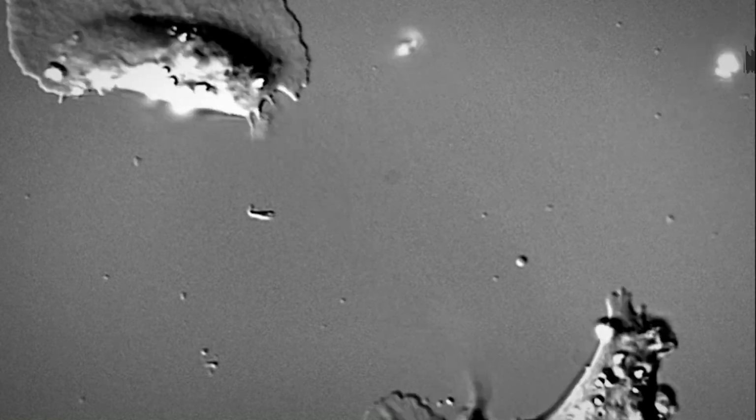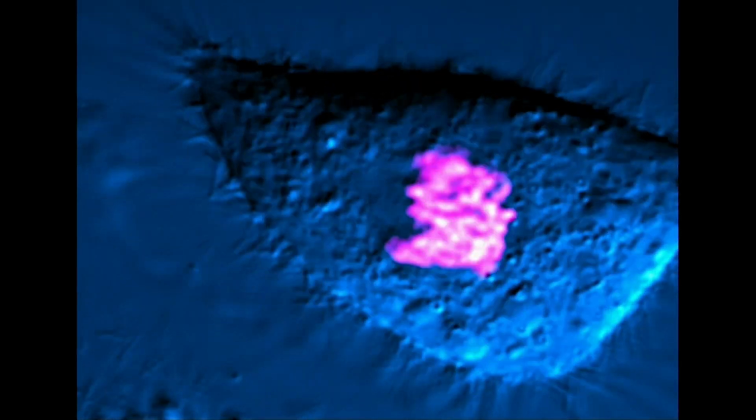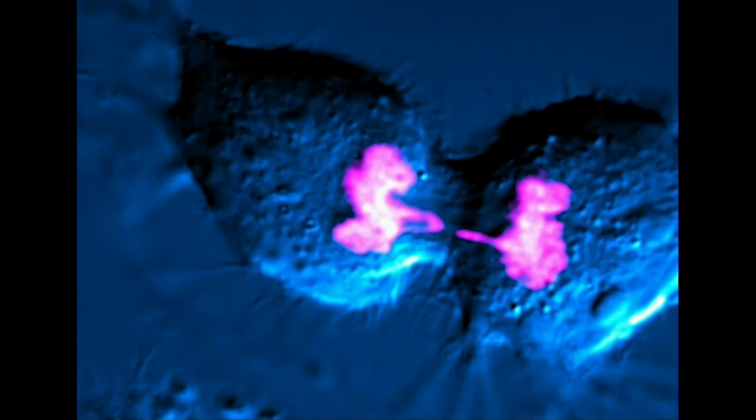This lets scientists not only have digital representations of their samples, but it allows them to make measurements about what they're doing. So you can say with very high accuracy how fast a cell is moving as it goes from one place to another, or how the shape of certain organelles change as a cell divides, for example. And this has catapulted biological research from purely using microscopy as an observational tool to being able to do rigorous quantitative, data-driven science with a microscope.